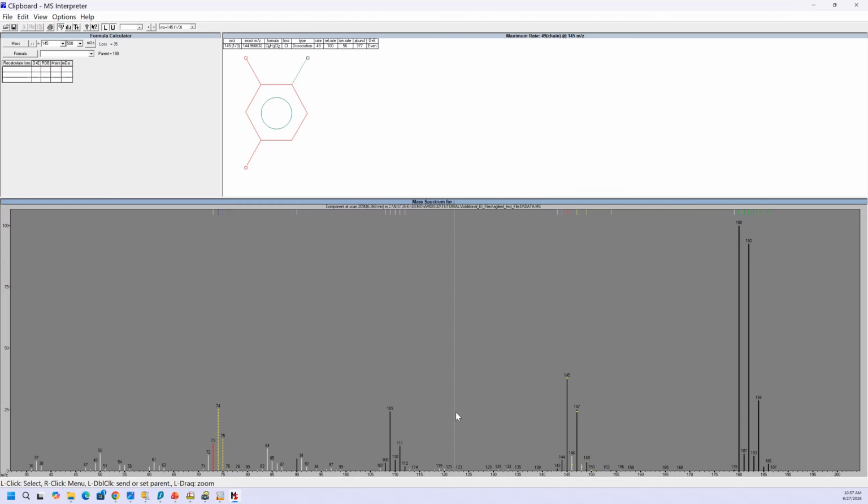You can go to the chromatogram tab and then send anything you want to MS Interpreter directly to have it look at the structure, if you do it in the bottom window where it has the library identity. But if you go to the top where it doesn't have one, you can send your spectrum over and propose your own structure for it in ACD, copy it in the clipboard, and put it back in.